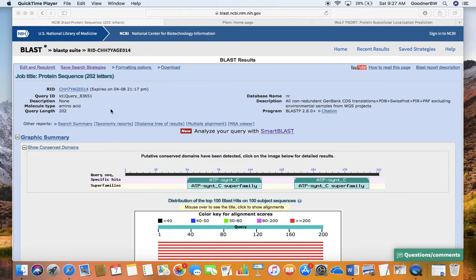In this short video, we're going to talk about some of the tools we can use to gather information that will help us put a potential functional name on our assigned protein sequences. So we've already seen how we could use BLAST as a way of finding an outgroup sequence from the human louse genome to use with our assigned bird lice ecomorphs.